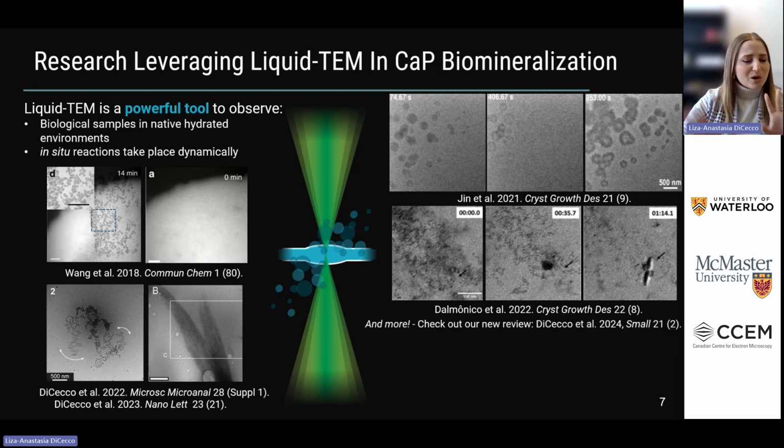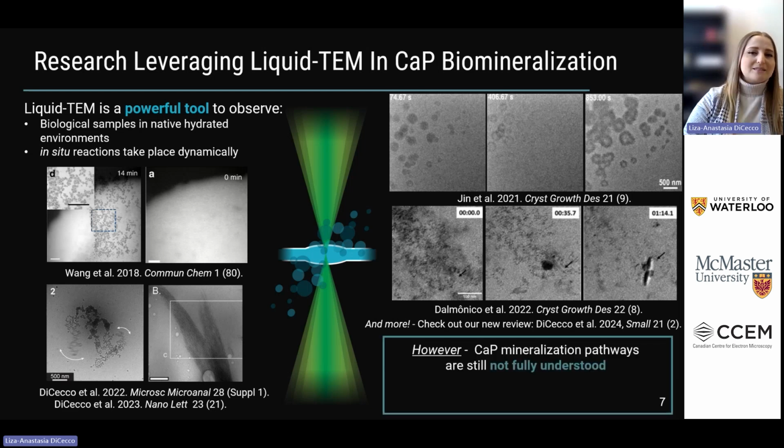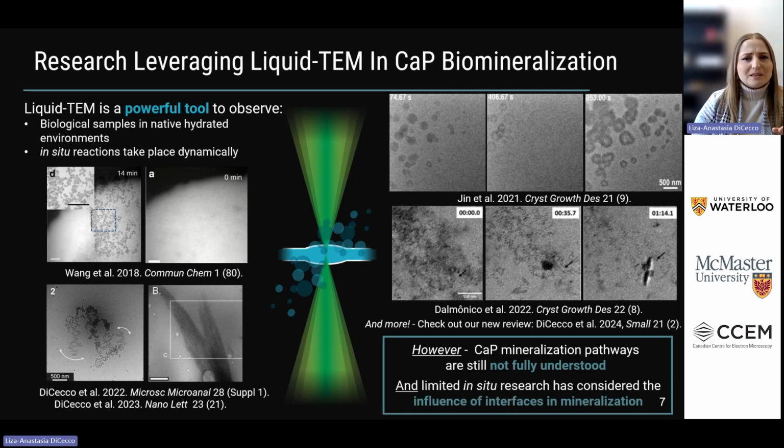In any case, there's a lot of work out there right now that's emerging, which is really great. You can check out our review paper that covers this and other biomineralization systems that have been studied in Liquid-TEM. But I'd highlight that these pathways are still not fully understood, and limited in situ research has considered the influences of interfaces in these mineralization processes, which are critical for nucleation and studying crystallization events in real life scenarios.